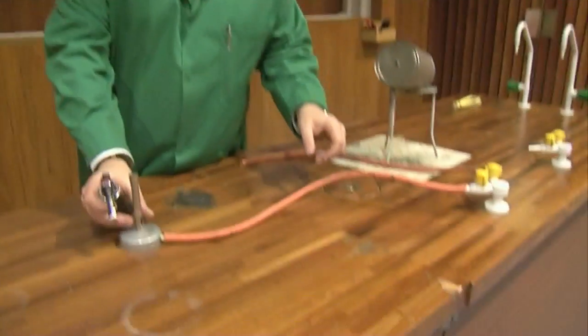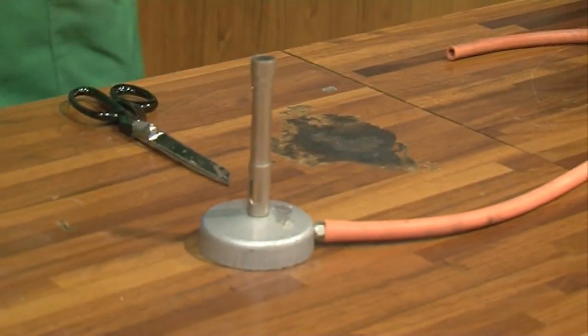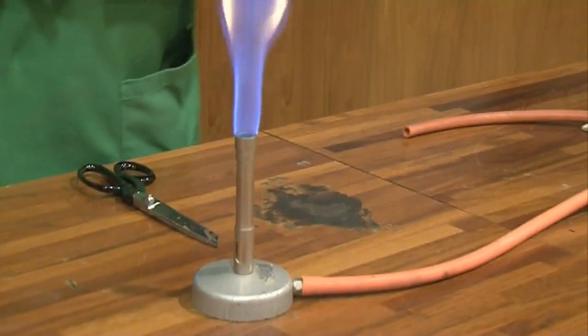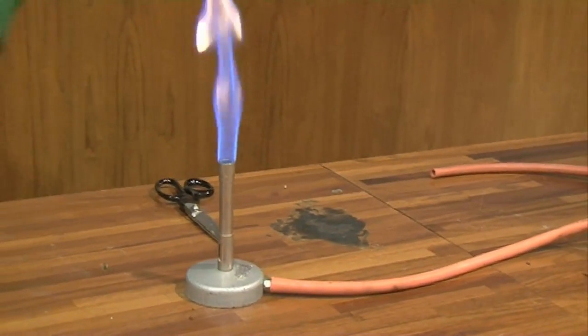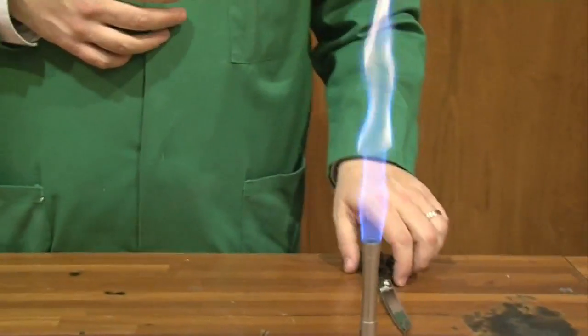So let's show you the combustion of methane. So simple combustion. We're going to use a Bunsen burner. I just need to light it. So you can see the methane is burning quite nicely in the atmospheric air and you're getting this rather nice incandescent flame.